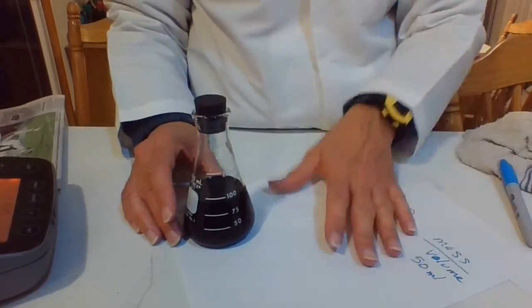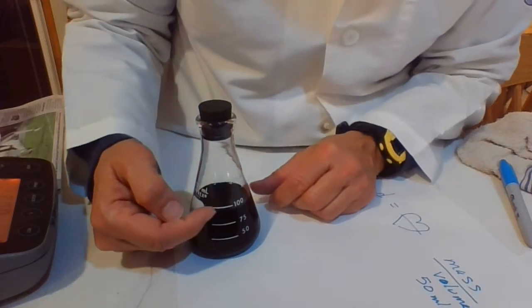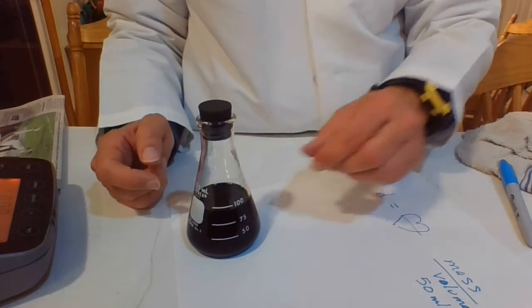Okay, so it's been about 5 minutes, and with the alcohol and water, you could see earlier that the volume was right on that 100 milliliter line. Now, putting it flat so that you can see, the volume has gone down significantly. It's now quite a bit below that 100 milliliter line.